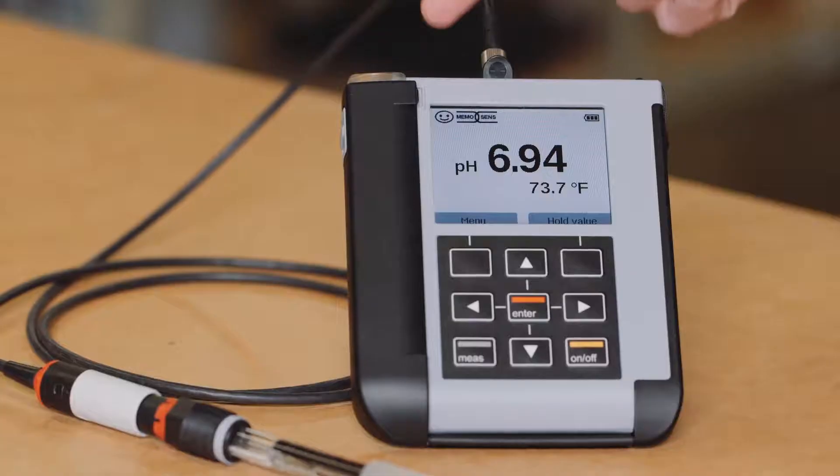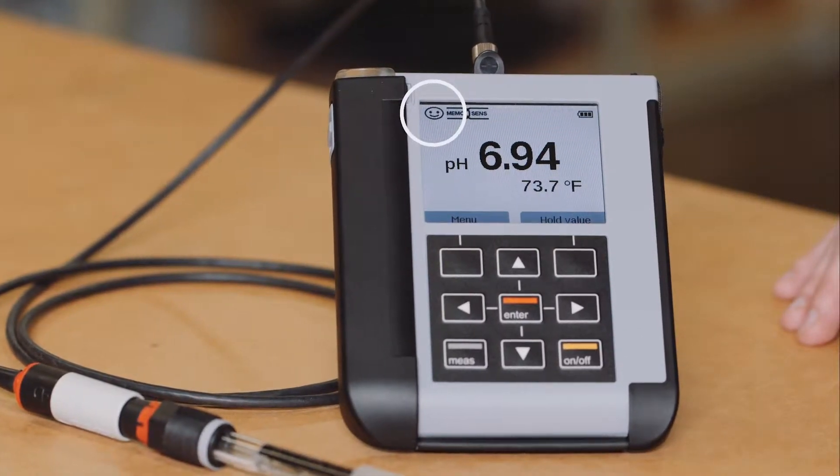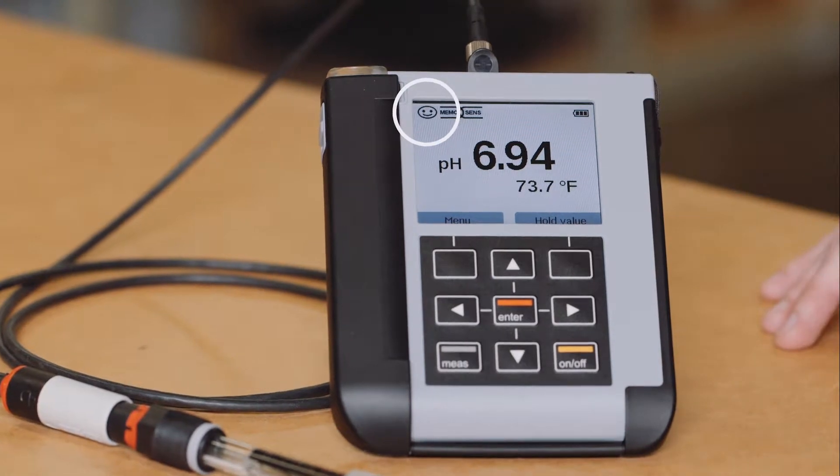One of the first things you'll notice on the main screen of your Portavo is the Sensoface. The Sensoface is a graphical indication of the condition of the connected sensor. It also gives the operator an idea if the sensor needs to be attended to.